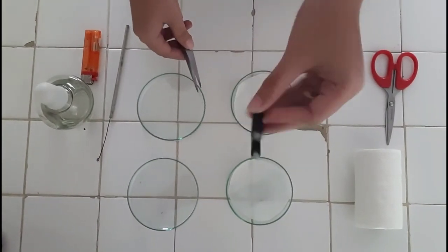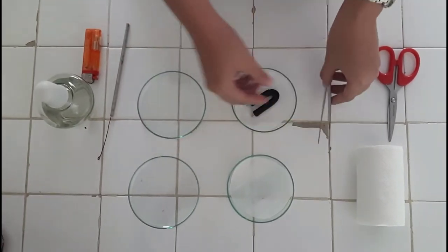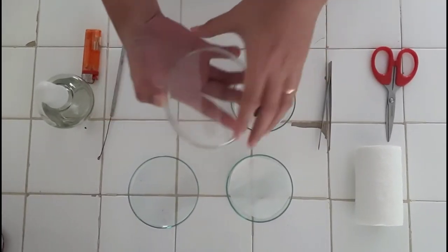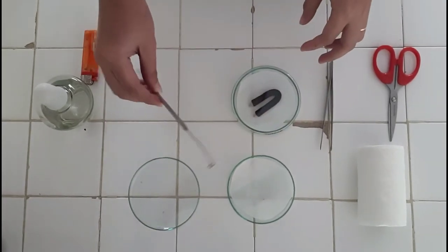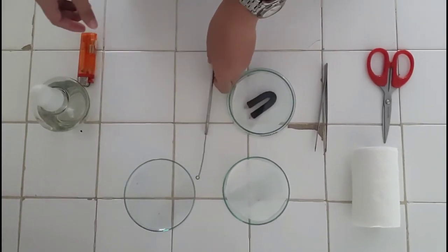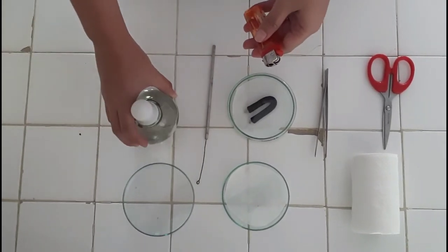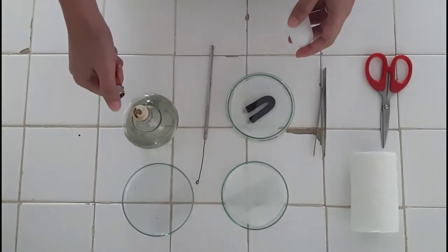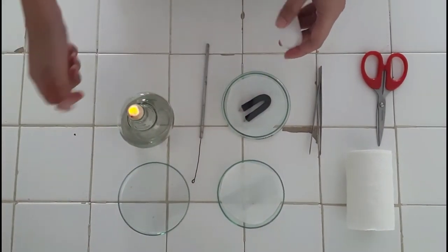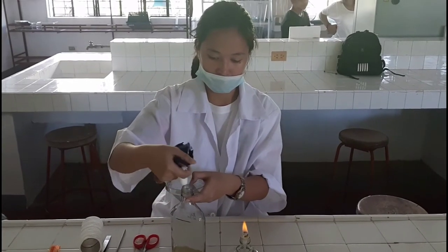The U-shaped block, petri dish cover, inoculating loop, a lighter for the alcohol lamp. So let's get started. Pull the cotton plug.